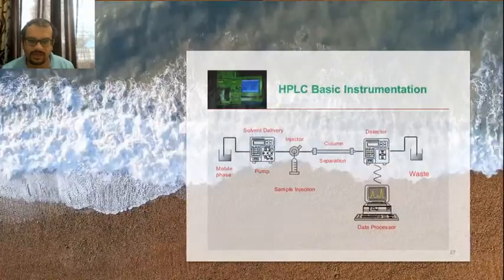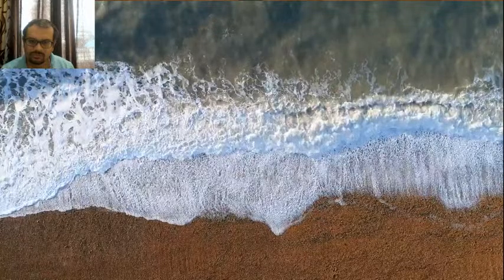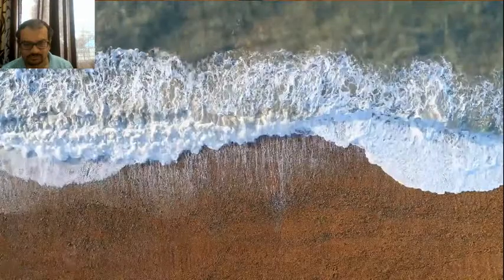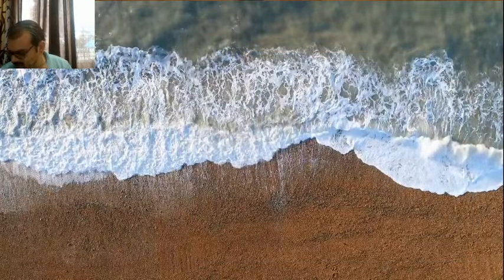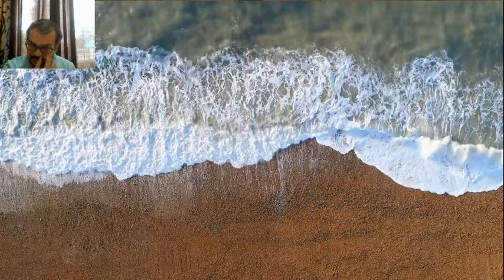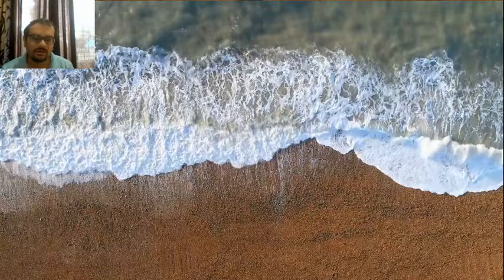So we have completed the basic instrumentation, composition of HPLC system, mobile phase degassing, solvent reservoir system, then pumping system, then column system, and lastly we are going ahead with detector system. Let's chat in the comment box what is the need of detector.